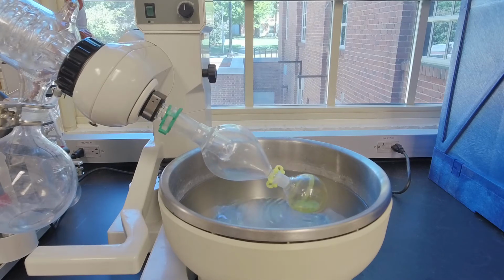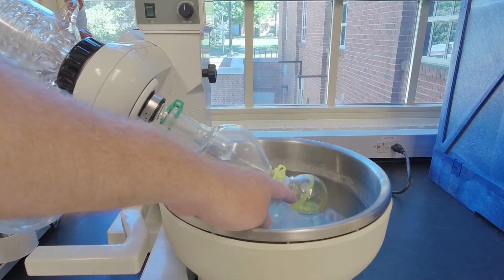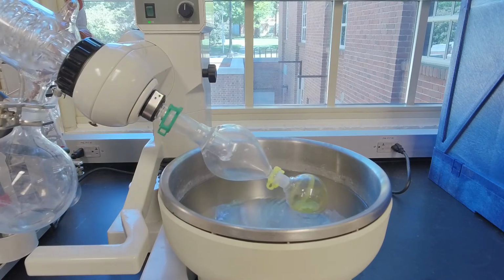All right. So you can see some solids starting to come up, right? We've evaporated enough solvent now that solid is starting to come out of solution. And again, we're like 5 minutes into this. So rotovapping is not a fast process. Distillation is not a fast process. And in fact, in almost any purification technique, the slower you go, the better your separation will be, the better your purification will be.